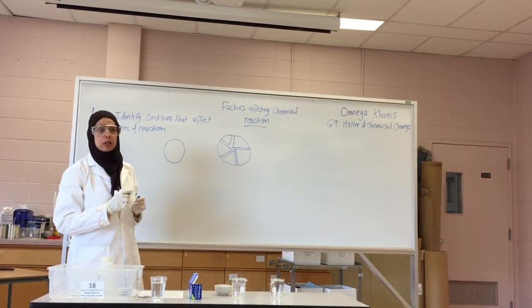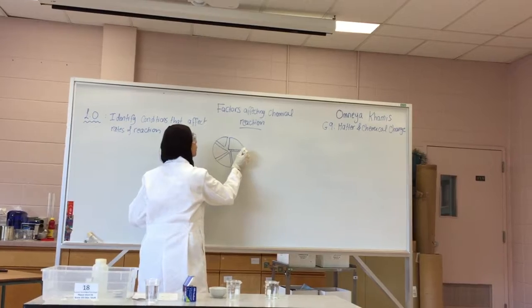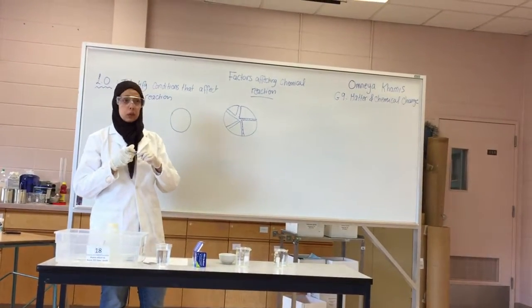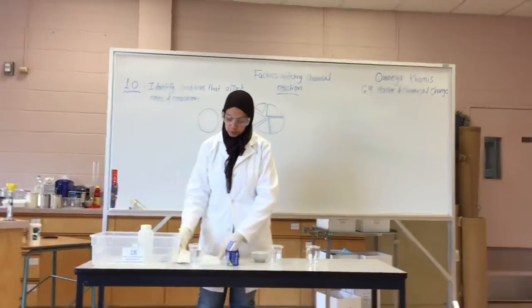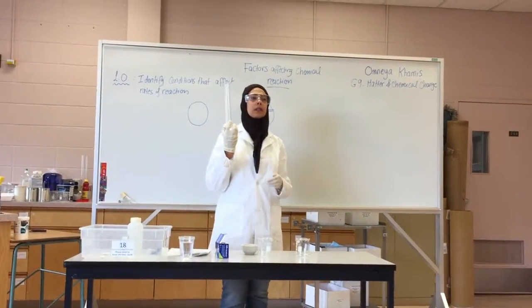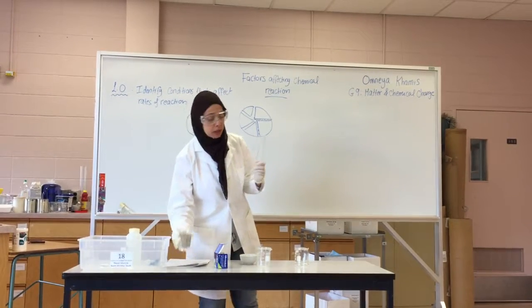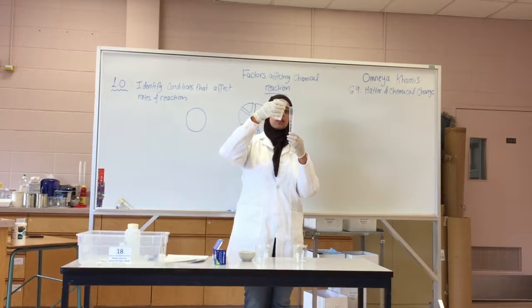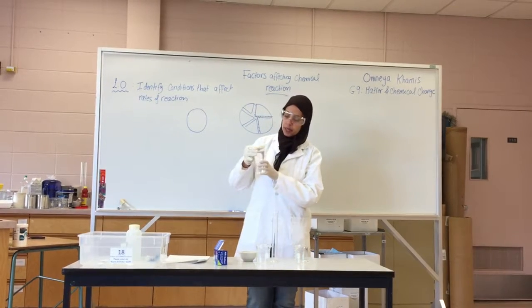Creating new edges, right? So I will have more particles of the tablet being exposed to whatever reactant I put in. Okay, so first of all, I will get, what is this? Graduated cylinder. Yes, and I will have 75 milliliters of water in each beaker.